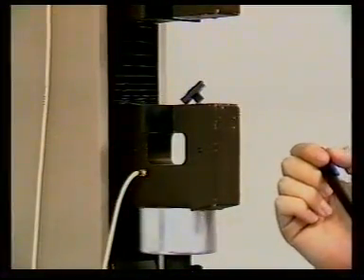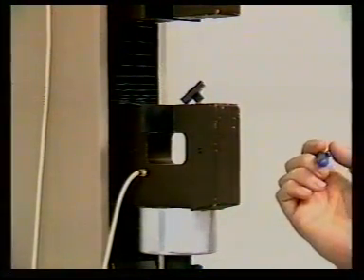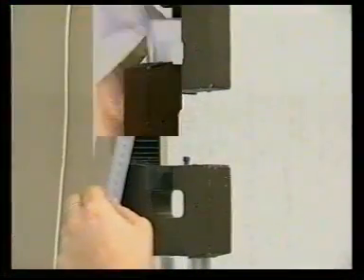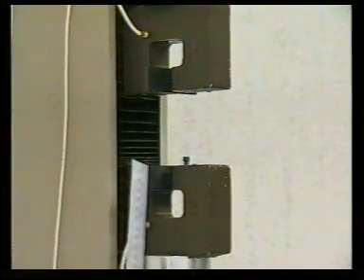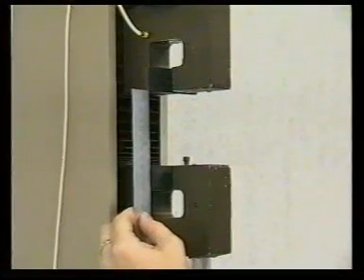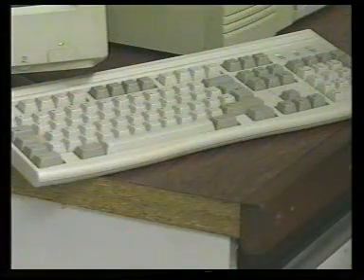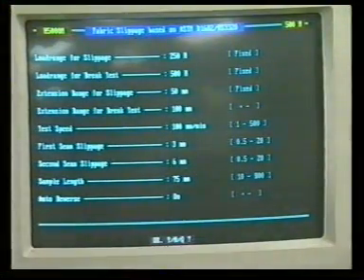The Hounsfield is set up with correct jaw faces in both top and bottom holders. The back jaw being 75 by 25 millimetres and the front face being 25 by 25 millimetres. The gauge length — distance between top and bottom jaws — is set to the specified distance. The appropriate test programme is selected from the computer and the specified details entered onto the screen.